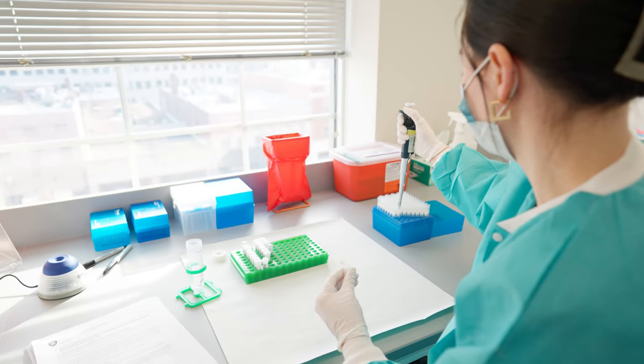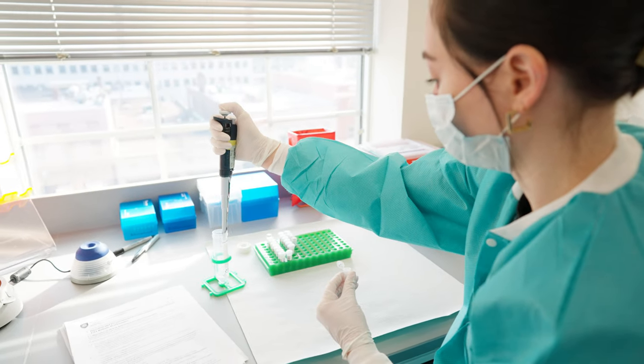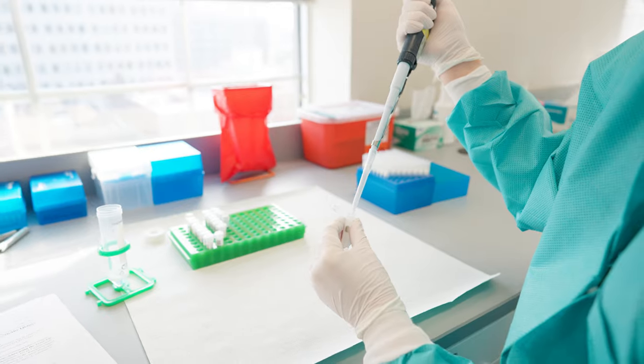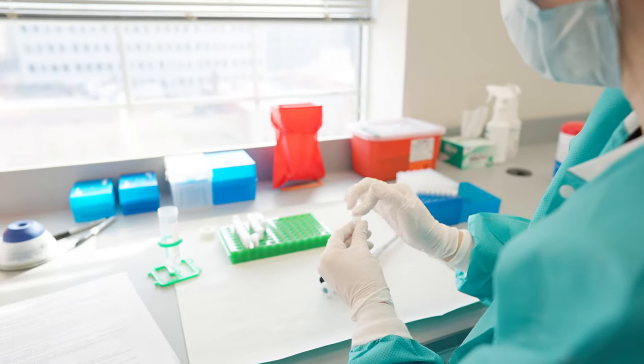We need to remove the proteins, cell membranes, and other parts of the sample that we're not interested in. This step is called extraction because we're extracting the DNA from the sample.